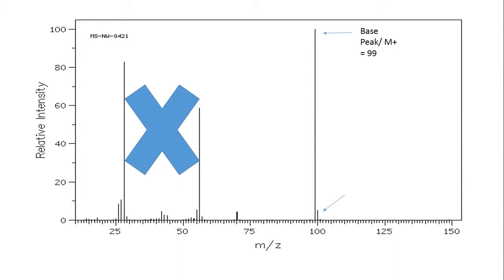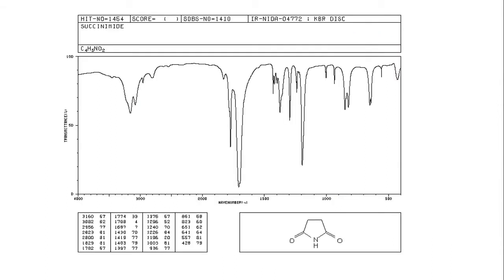Now would be a good time to look at our IR graph to see if we can determine if we are dealing with anything besides carbon or hydrogen, since the MS doesn't give us much more than the molecular mass of the compound. So here is our IR graph.